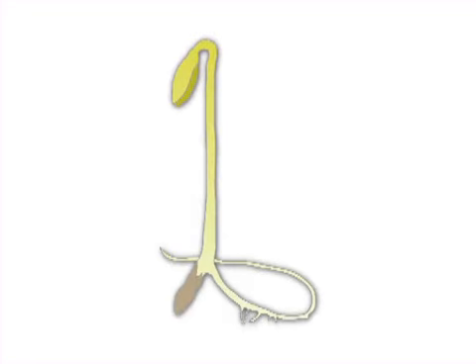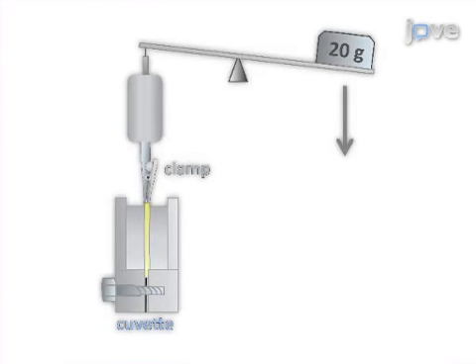Here we demonstrate methods for measuring expansin activity by cell wall extensometry. Suitable wall specimens can be prepared from the hypocotyls of etiolated cucumber seedlings. To measure acid-induced extension, which is catalyzed by endogenous expansins bound to native cell walls, we clamp the walls at neutral buffer and an extensometer.